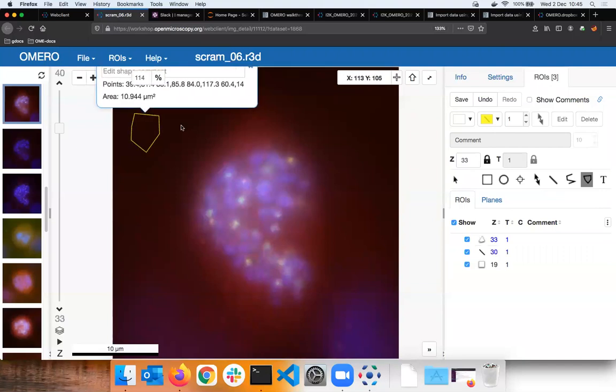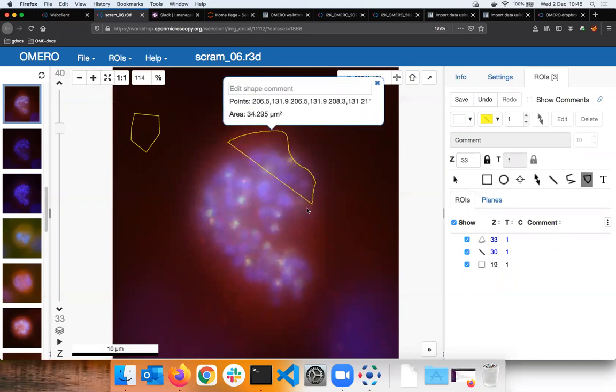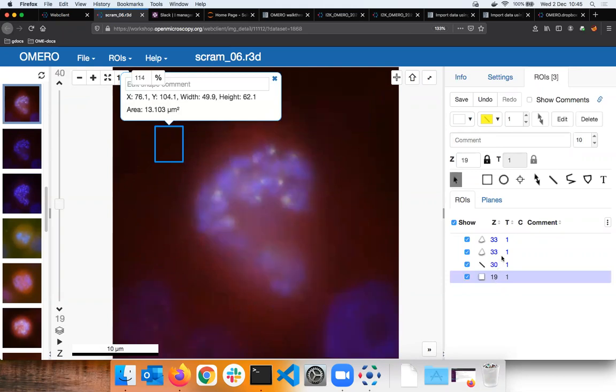Okay, and double click and finish. That's fine, but I can do freehand, and this is done by pressing Shift. With the left hand, I'm pressing Shift on my keyboard, and now I click and drag. I'm not letting go of the mouse button. I can't show you my finger on the right-hand side because I'm holding the mouse button here. And then I let go, and the freehand polygon is shown.